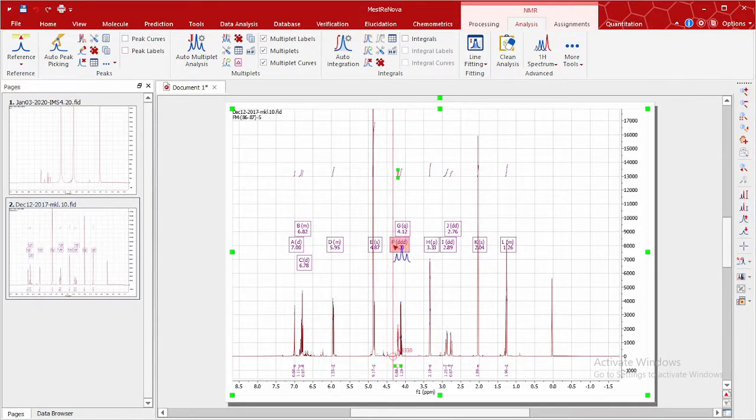The first way to look at our J value is to point your cursor to any peak that has a doublet, triplet, multiplet, and above. You cannot calculate a J value for a singlet because a singlet is a singlet. You can only calculate the distance between two things, not only one thing.